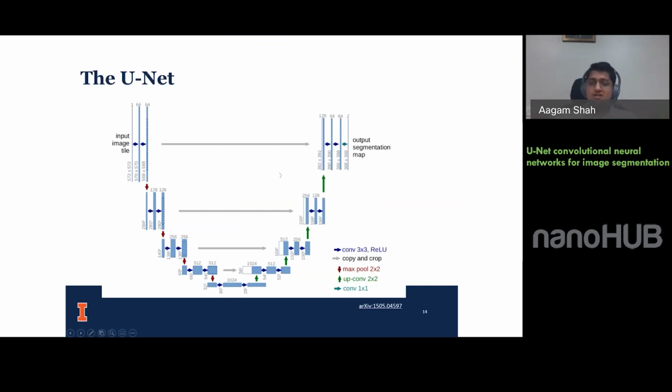When we contract the image, we are essentially losing some data. What we do is we retain only the most relevant information. In this latent space here, the 2 images of graphene that look different at the beginning will look almost the same.